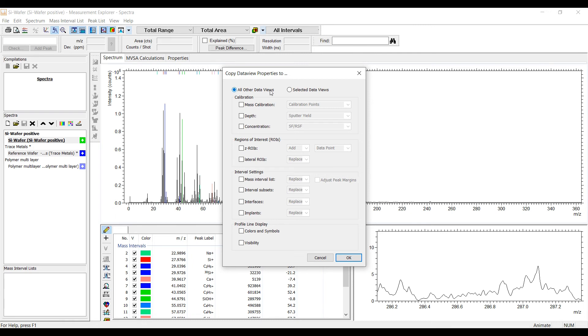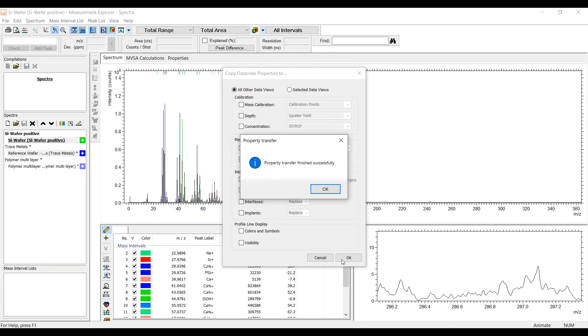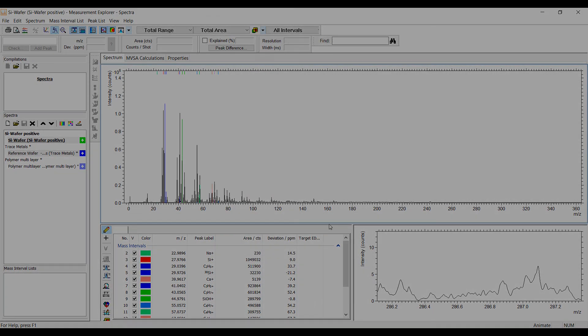Choose with the radio button if the selected parameter should be transferred to all other data views which are currently loaded in the data list or only to the selected data views in the data list. Select which properties you would like to transfer and specify the details if needed.